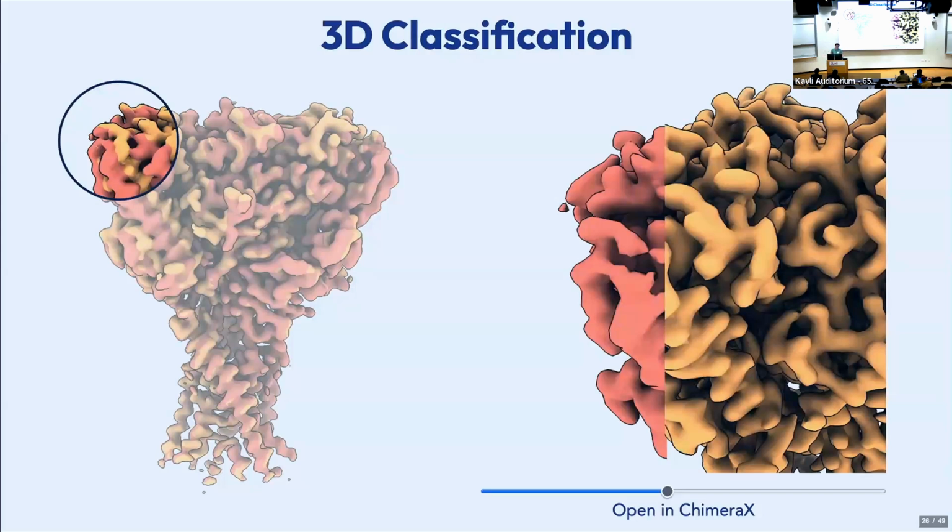And then you can try either a global refinement or you can try and figure out what orientation, like if it has 1 ligand, is the ligand there, there, or there? That's a little more tricky, but you could try. I would generally say if you group them and then try a global refinement, that might work best. Or you could try a 3D classification, since you know this group of particles only has 1 ligand. You could do a classification with 3 classes and see where that ligand ends up.